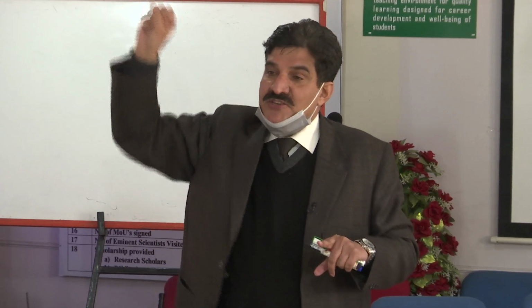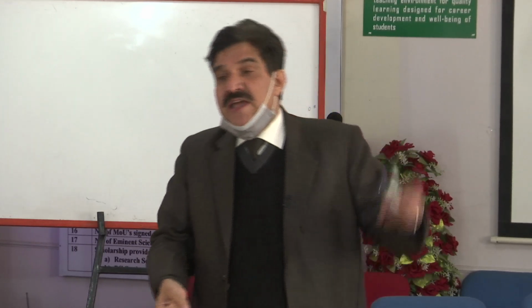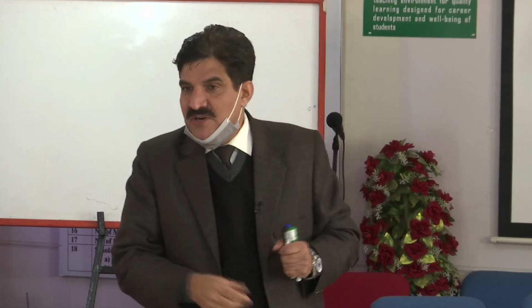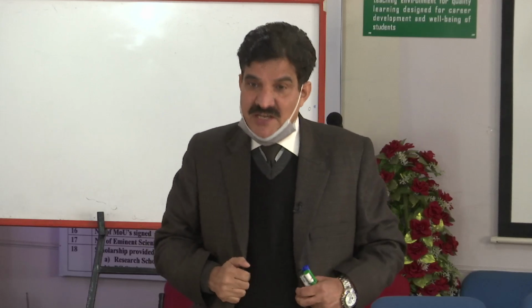And this amphipathic nature is capable of disrupting the interactions of membrane proteins, as well as the phospholipid membrane, which is associated through bilayer system, and that is ruptured by the long chains, because hydrophobic interactions are involved there.